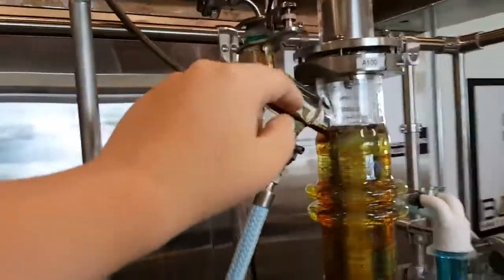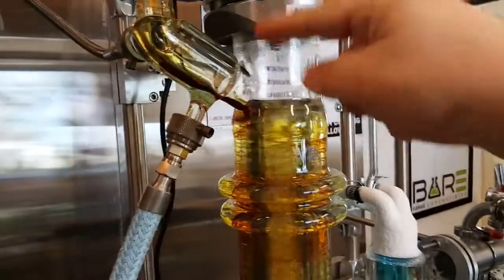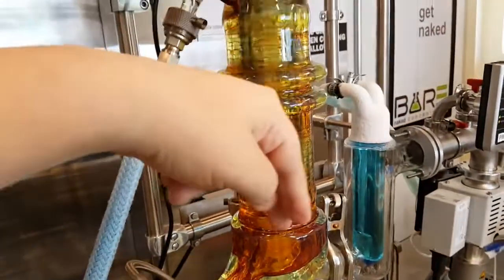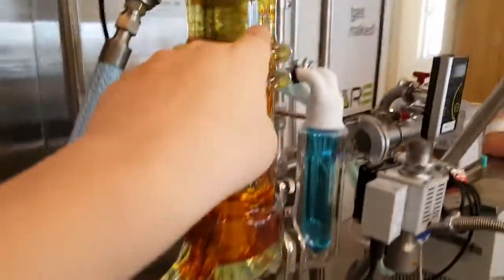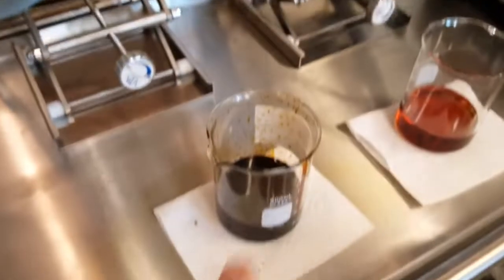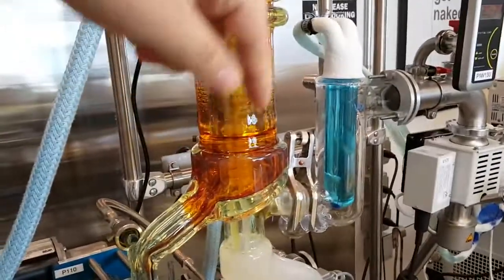It comes into here where everything is jacketed, and it's hotter in here so it can vaporize the oil. This brush thing keeps it at a thin film, and the oil evaporates as a gas — like when you're dabbing — and it condenses in there. But it's not hot enough to vaporize this black stuff, which is the heavier material you don't want.